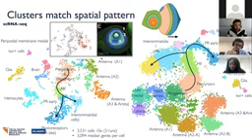So how do we know which clusters represent which domain? As you can imagine, this is based, like usually, on known marker genes. And here's just one example of Distal-less, which is expressed in the 2nd and the 3rd segment and the arista, but not in the first antennal segment. And that's, as you can see here. And so that's why we are able to find all these clusters back.